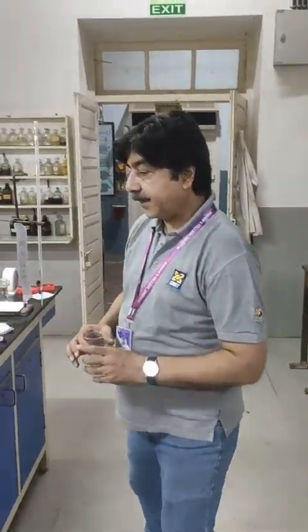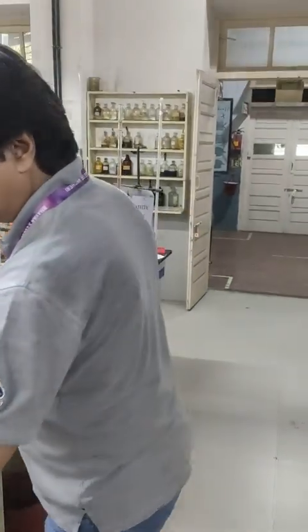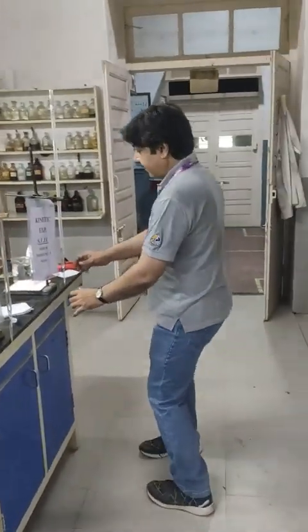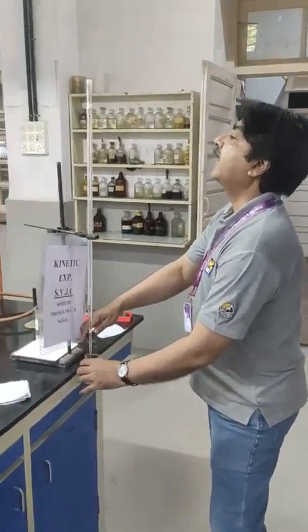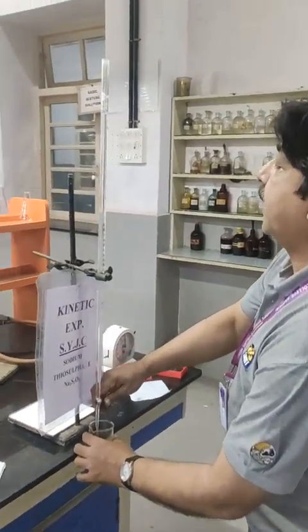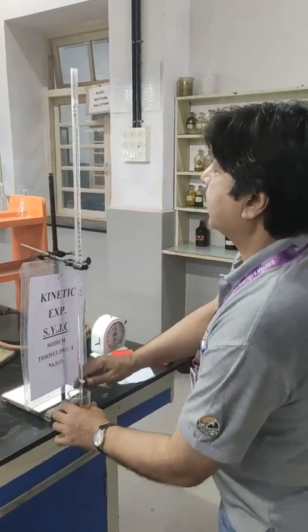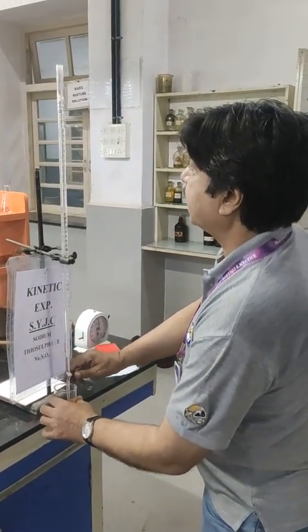First, I am taking 20 ml of sodium thiosulfate. I will start from 0 and I will take 20 ml with the help of this burette.